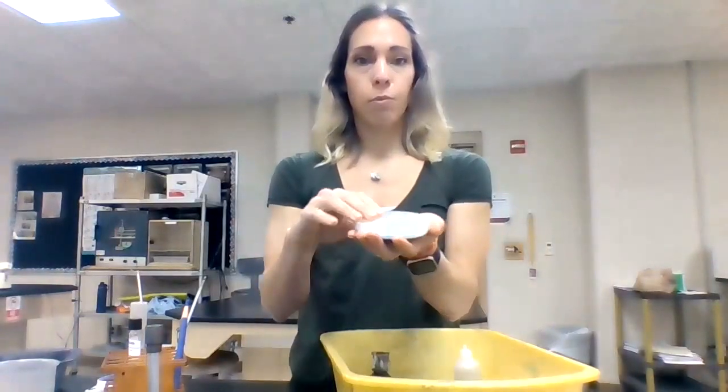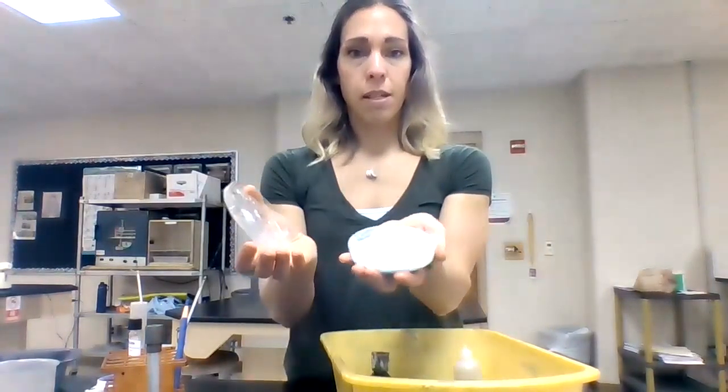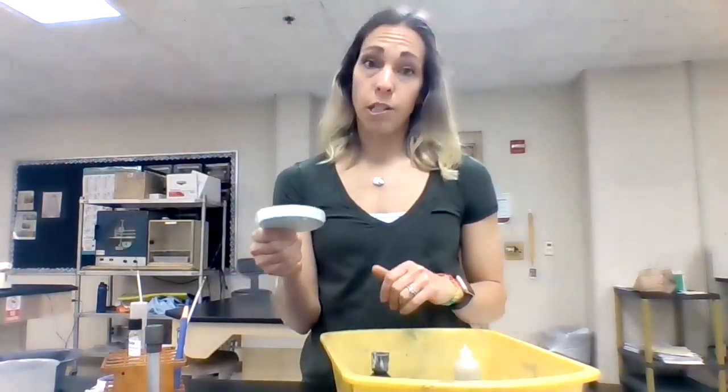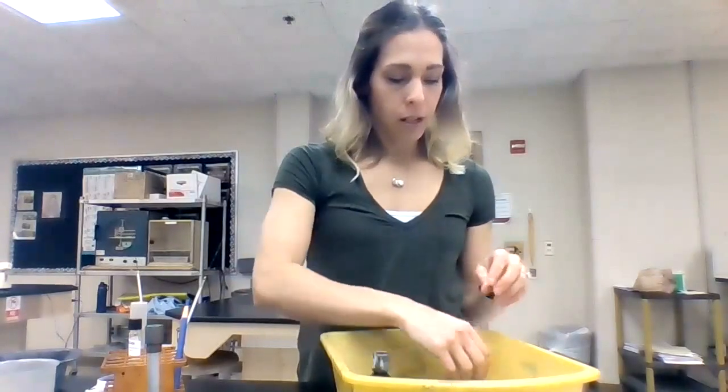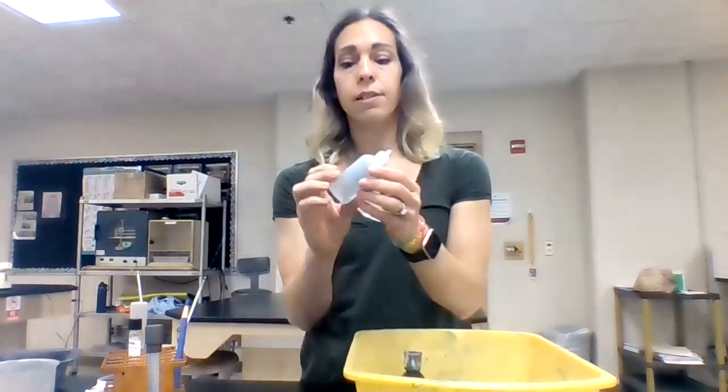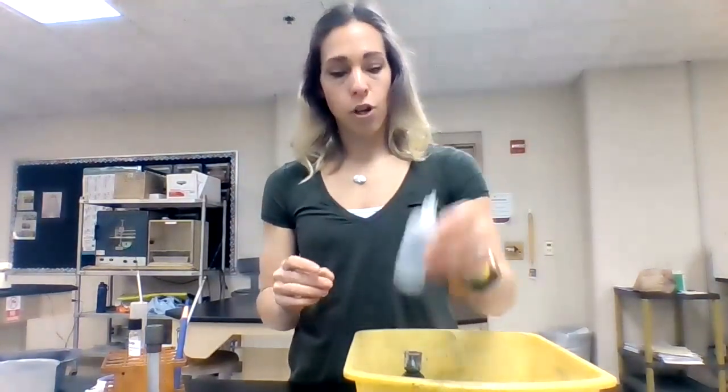You have a petri dish filled with green soap — it's going to be that powdery soap. It contains bleach, so be careful with your outfits, but this is how we're going to scrub our slides and stuff when we're done. You have a clear bottle with alcohol, and it's going to be a different shape than a lot of your stains, so you should have some type of alcohol bottle.